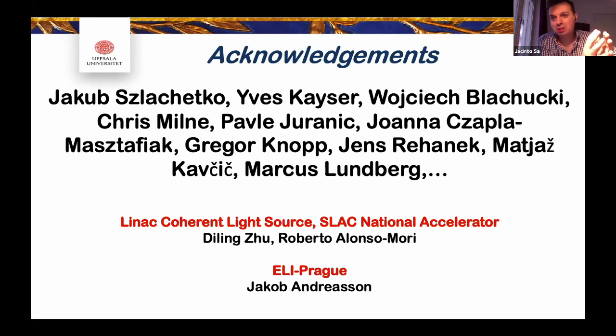So what we did is, for example, experiments with different focusing. We could focus the beam at the beginning of the jet or passing through all of the jet. We also could attenuate the amount of flux. So we spent quite a lot of time trying to find these thresholds between single photon and multiple photon absorption and this saturation process.